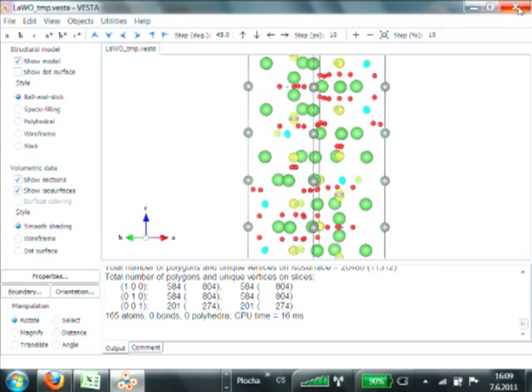Yeah, so of course, if you have some information on the composition, it always helps to use it. So in a clear case like this, the fact that there were 3 formula units was just an artifact, the default value suggested by Jana. I didn't change it. So Jana didn't make any assumption about the number of atoms. It just looked at the peak height and thought, okay, this is high, this will be tungsten, this is low, this will be lanthanum, and so on.